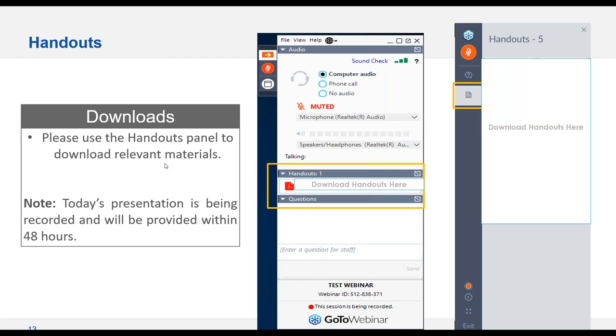I get this question once in a while. Is there any level of measurement that's considered too low to use a T-fitting for internal standards versus just spiking it in individually? I'm not quite sure. I think they mean if you're doing ultra trace work.